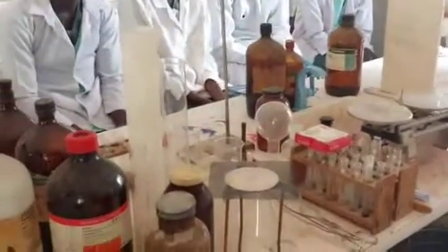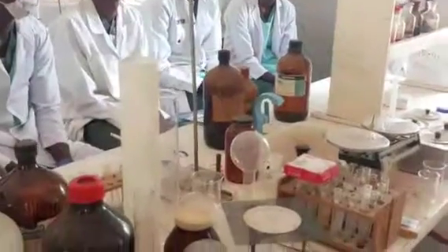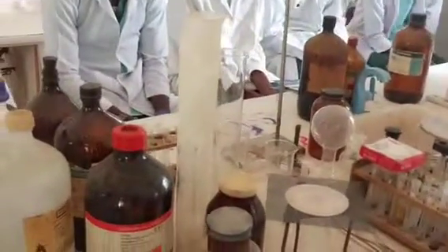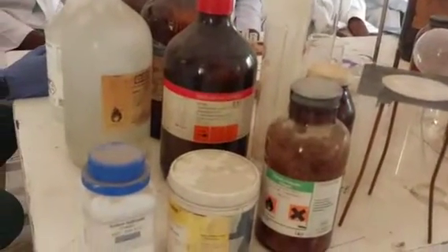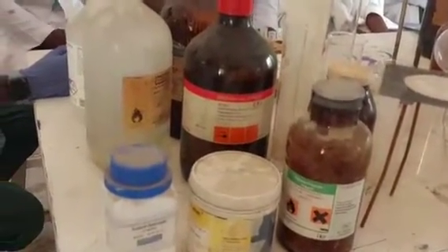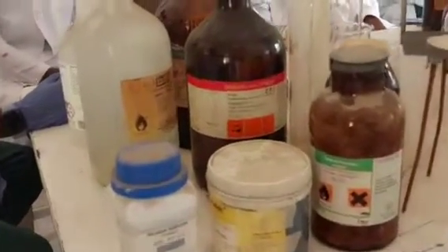So as a good researcher or a good chemist, if we are going to have an experiment on this chemical, what do you need to do? You should go and make research on the chemical to be used. Which type of chemical am I using? Is it flammable? Is it hazardous? At least you should find a little knowledge on the chemical before you use it.